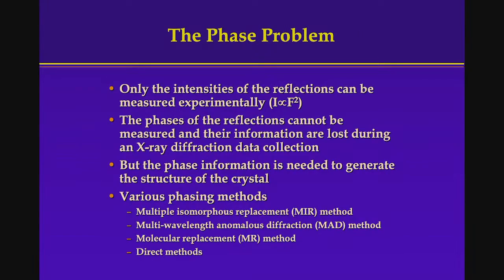Okay, phase problem. So I mentioned X-rays are waves. So I spent a lot of time talking about data collection to give you intensity.